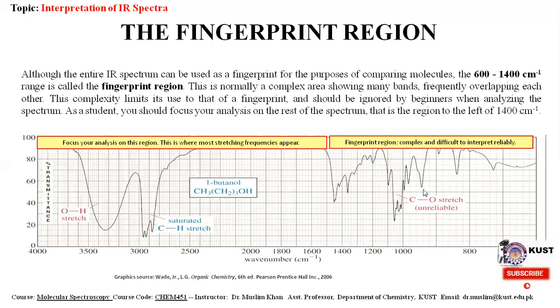As a student, you should focus your analysis on the region of the spectrum to the left of 1400 centimeter inverse up to 4000 wave number.